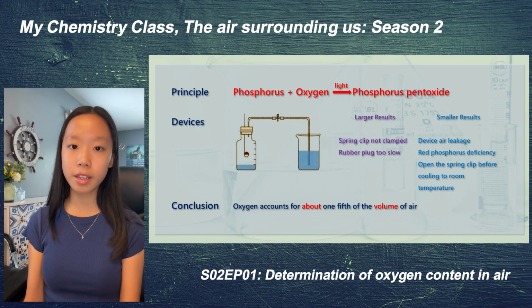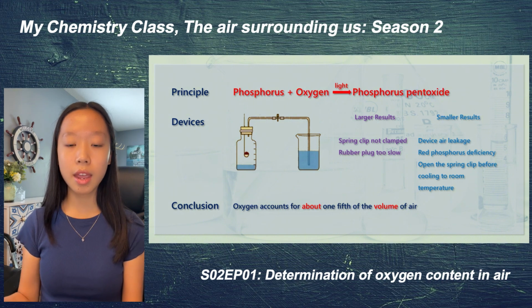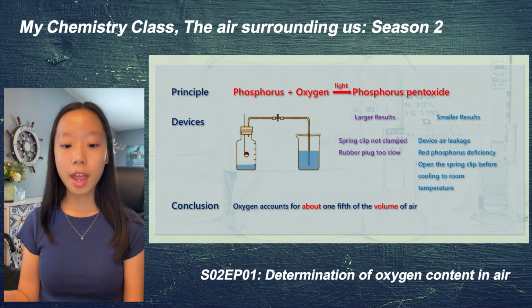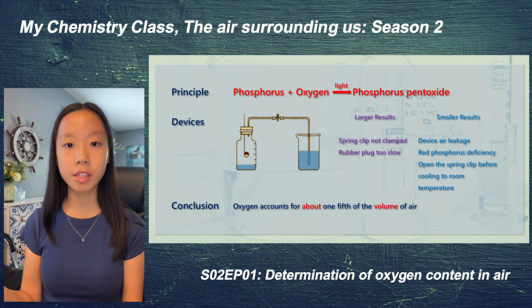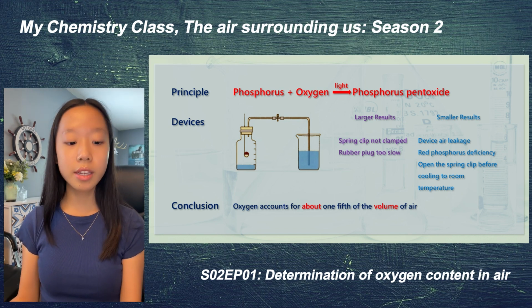So here are the things that we will need. We need a gas collecting bottle, a burning spoon, a double hole stopper, a catheter, a spring clamp, and a beaker. And here are the steps.